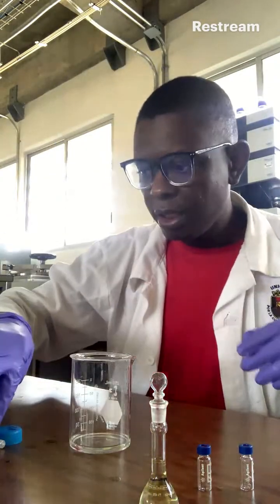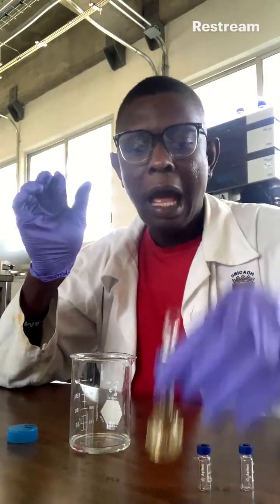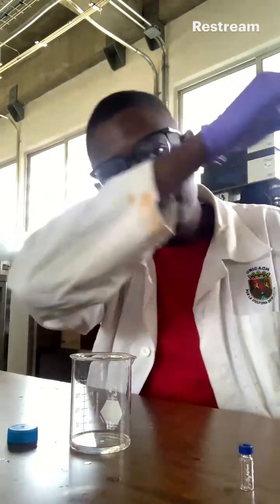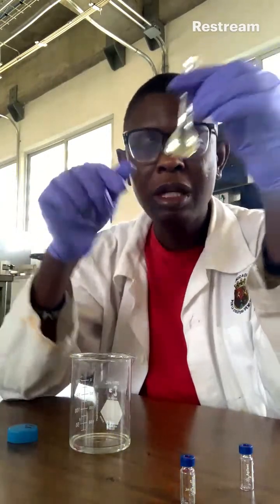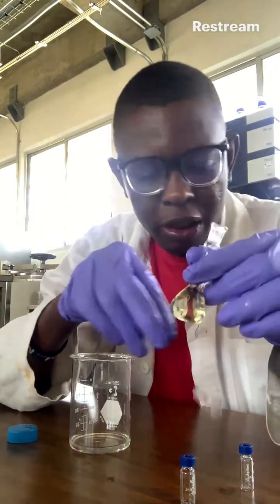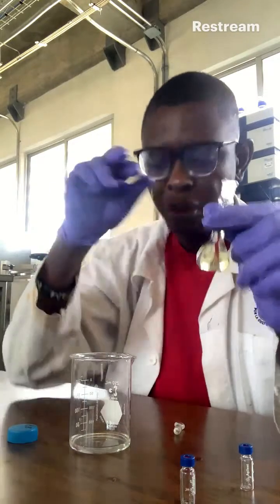What next? Okay. So guys, what I'm doing is I have prepared my stock samples and I have diluted them and I'm putting them into this bottle so I can now transfer them to the gas chromatography machine for separation, to calculate the peak areas and know how my reaction happened. Because this is a glycerol carbonate I made, and I made this using agave as the catalyst at a mild temperature.